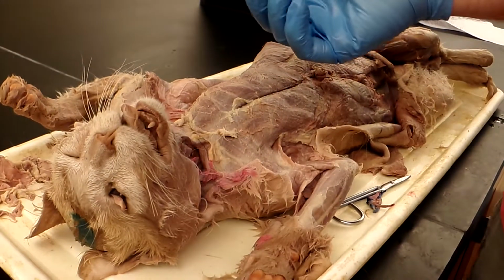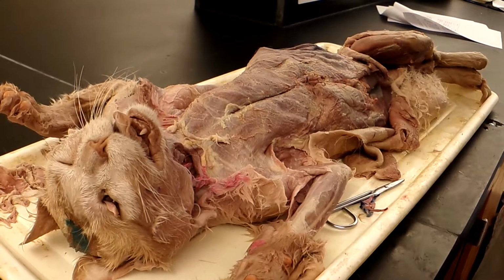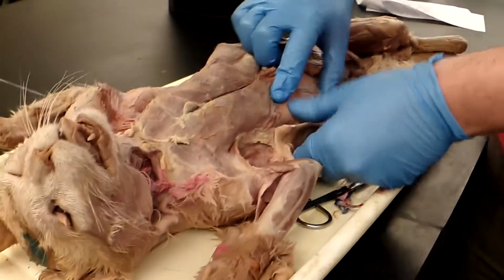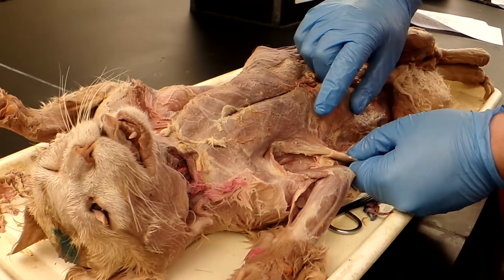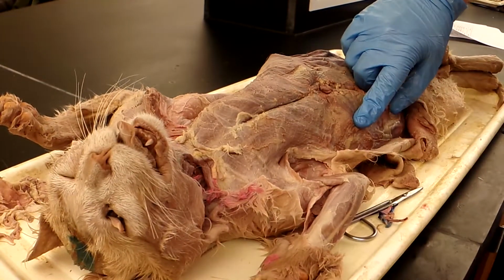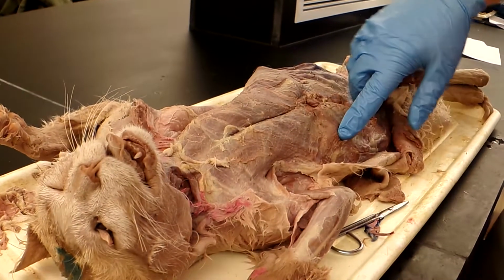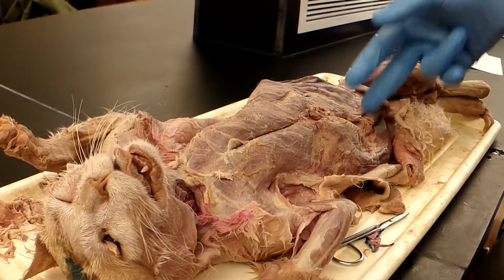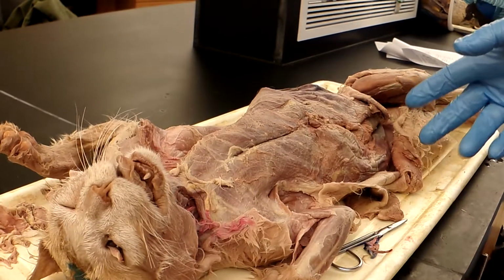And finally, the xiphihumeralis is located down here. The origin is the xiphoid process. The insertion is the humerus, and the function is to adduct and retract the arm.